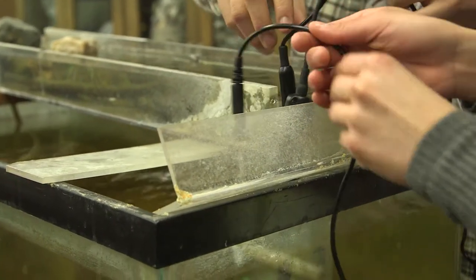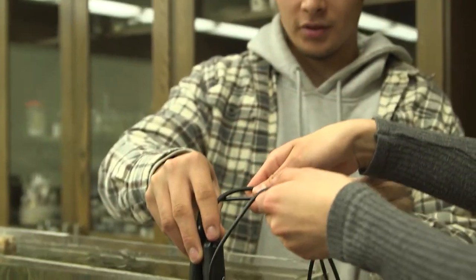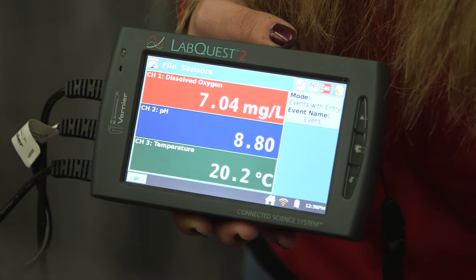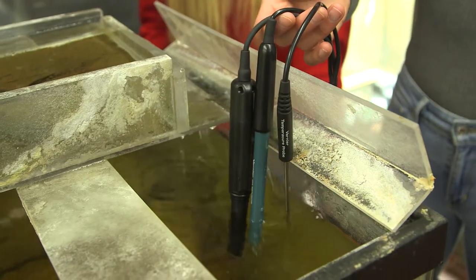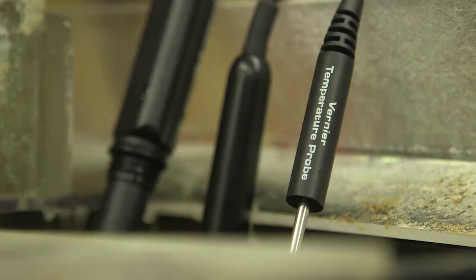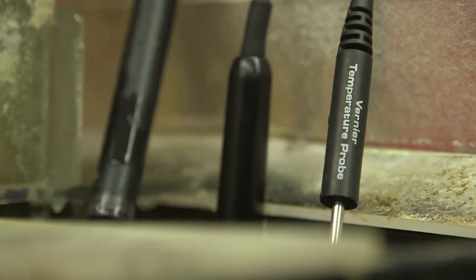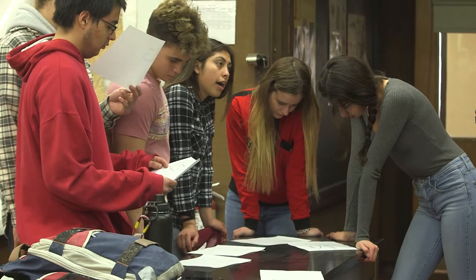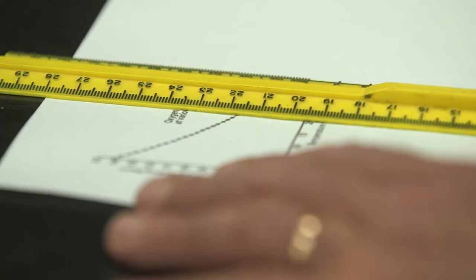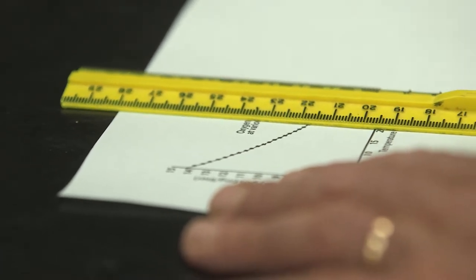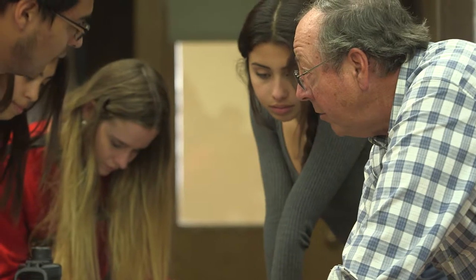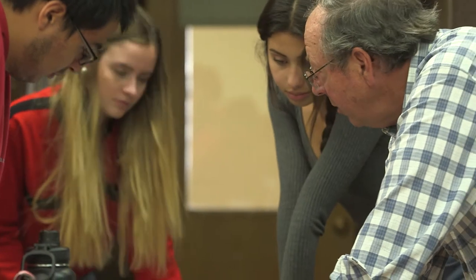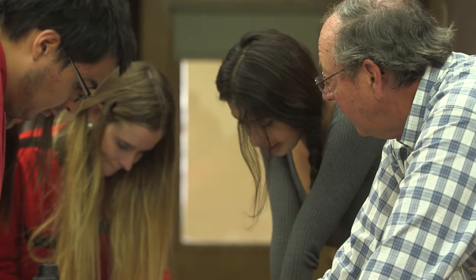Let's go ahead and take your samples right at this point where there's an inflow and you can see the bubbles are mixing in. Let's let it stabilize. With this volume of water it may not change significantly. So tell me what this chart shows you — dissolved oxygen versus temperature. What kind of relationship? Higher the temperature, the less dissolved oxygen. If you use a ruler, what would be the theoretical level of dissolved oxygen? If it was just the temperature of the water, then the maximum solubility would be 9. As the temperature gets lower, the solubility of oxygen goes up.